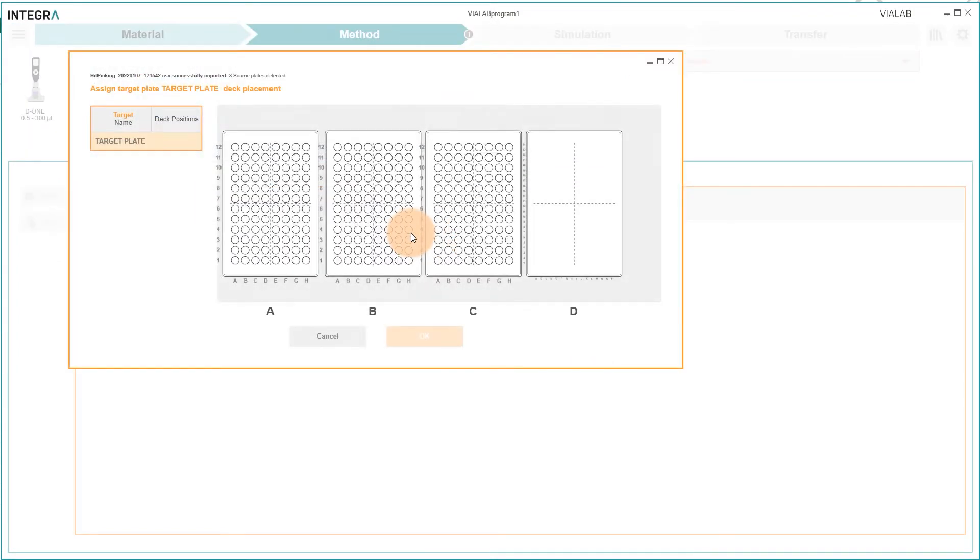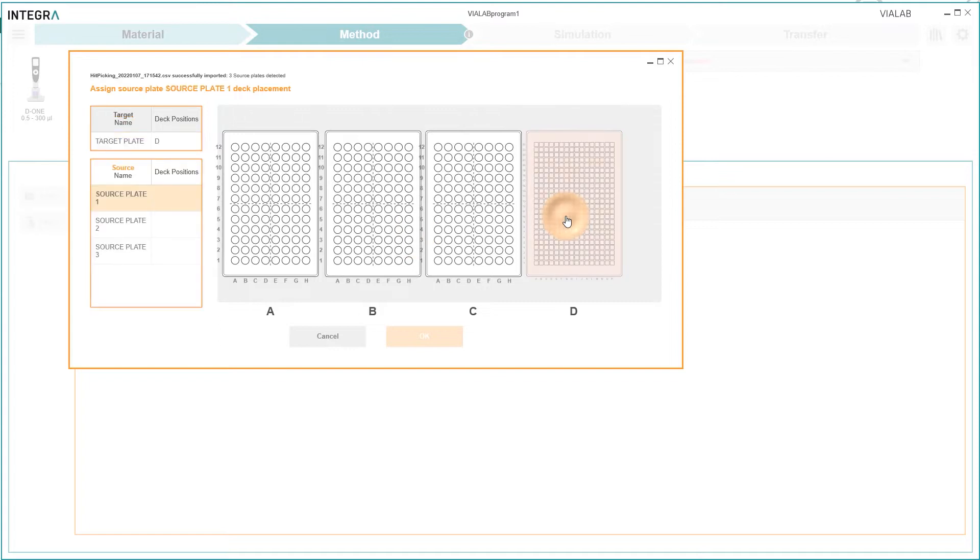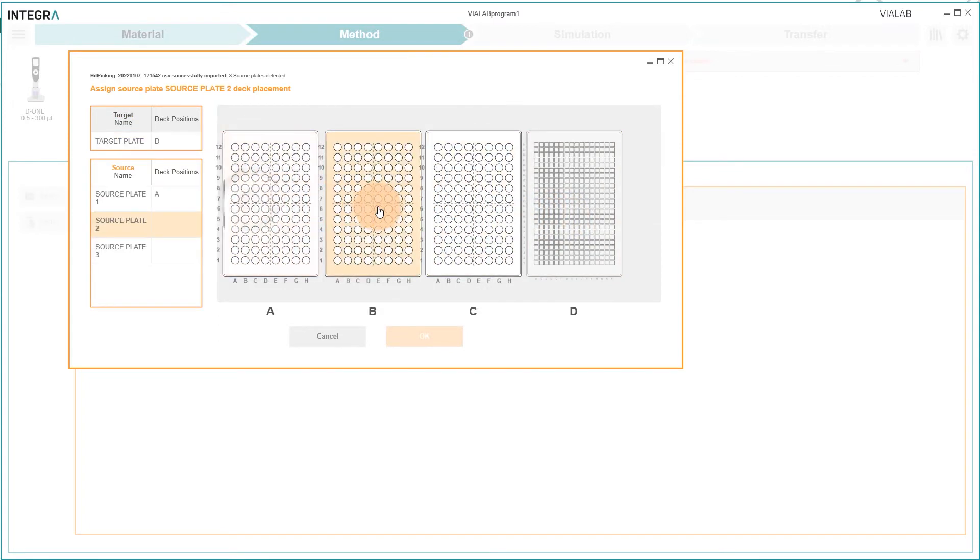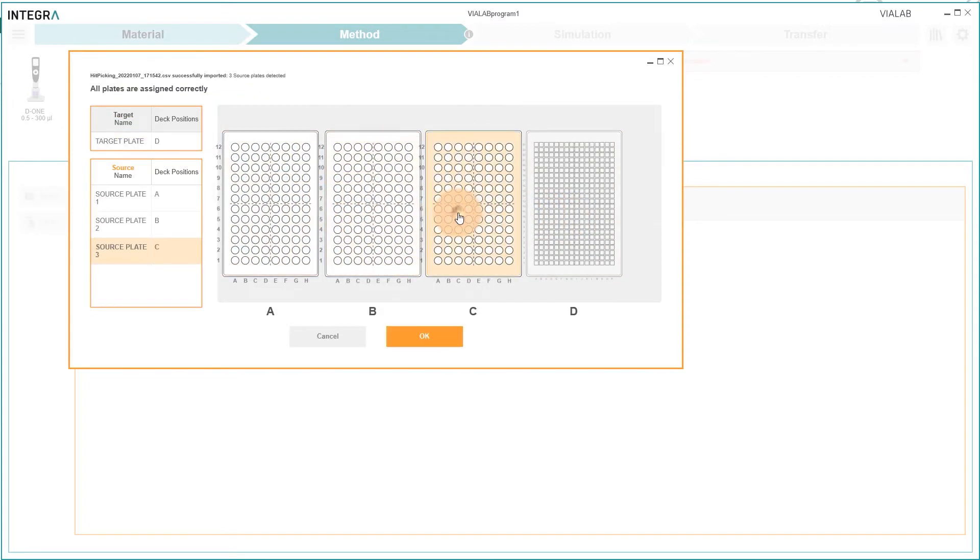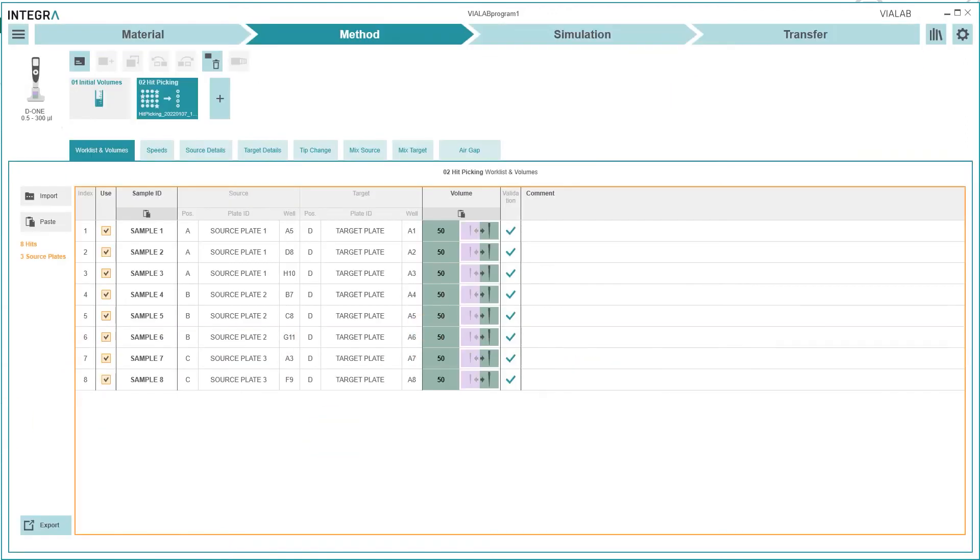Firstly assign where the target plate and then where the source plates are positioned on the deck of the Assist Plus. Confirm the step and the imported worklist is displayed in Violab.